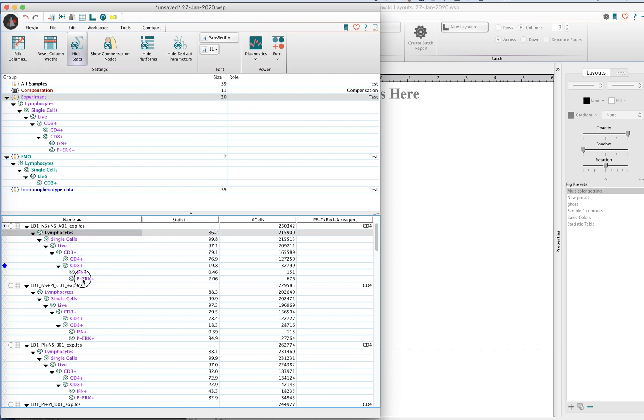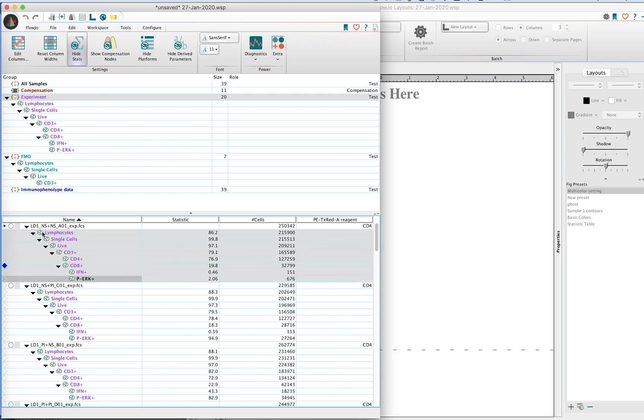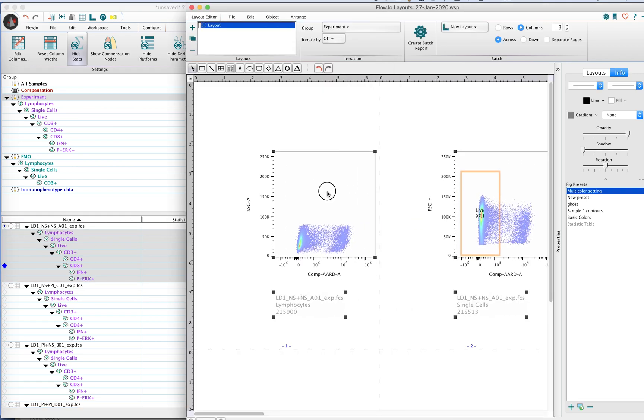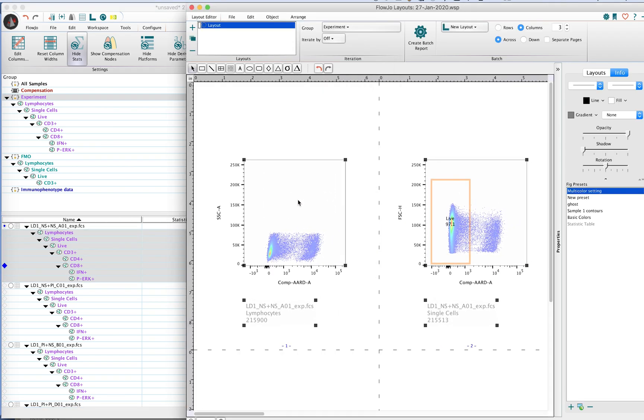The easy way to add plots to the layout editor is to simply drag and drop plots or the populations that you have in the workspace into the layout editor.